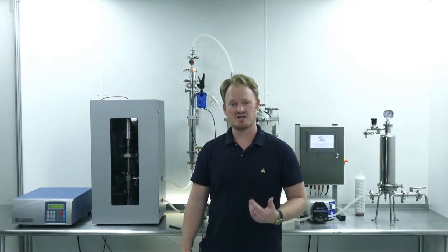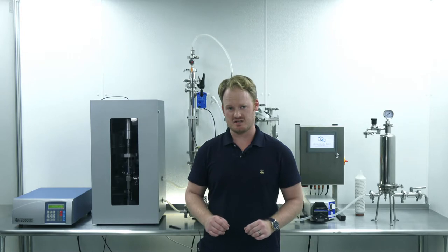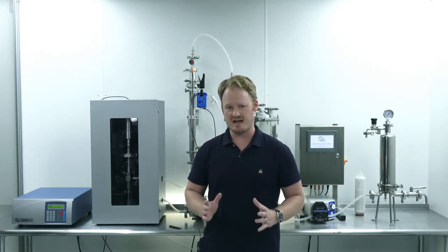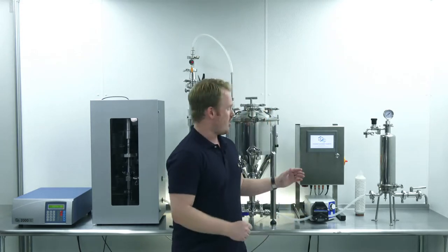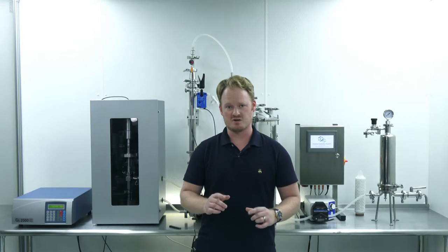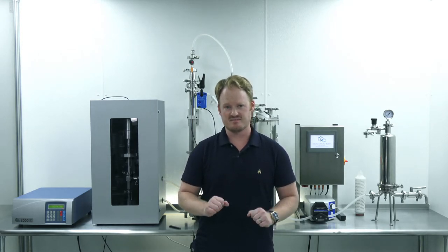Hi, I'm Josh Detzel, founder and chief scientific officer of Canisal Technologies. Today, I'm going to show you how you can make an 18 liter batch of a cannabinoid containing nano emulsion using our CT2000 turnkey package with optional automation upgrade in conjunction with NanoOptimizer, our proprietary industry leading surfactant system. Stay tuned.